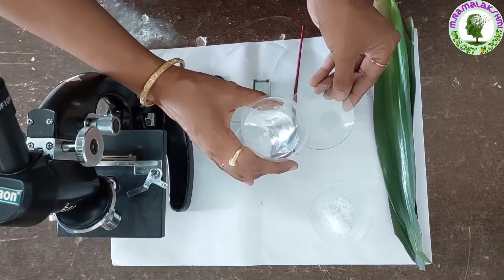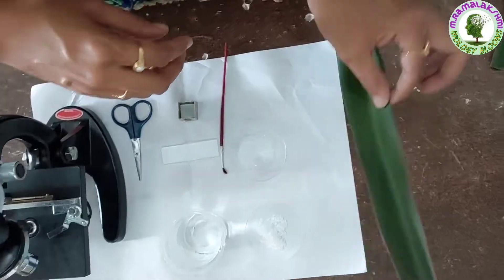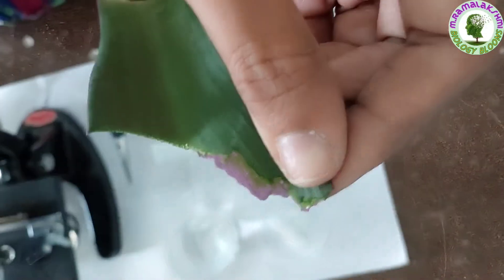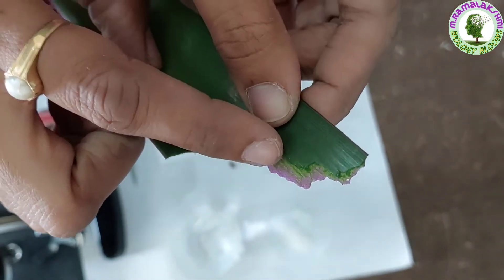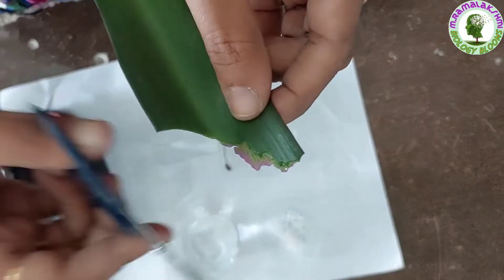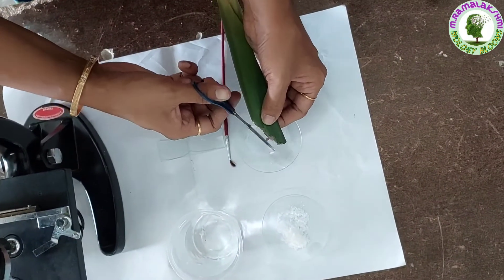Children, take some water in the watch glass. Now take the reo leaf and tear it in a single stroke. Observe the transparent colored portion. Cut it with the help of the scissor and place it in the watch glass.